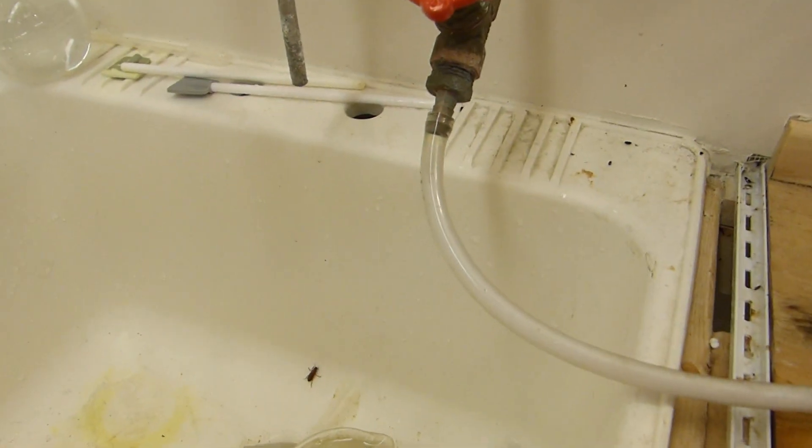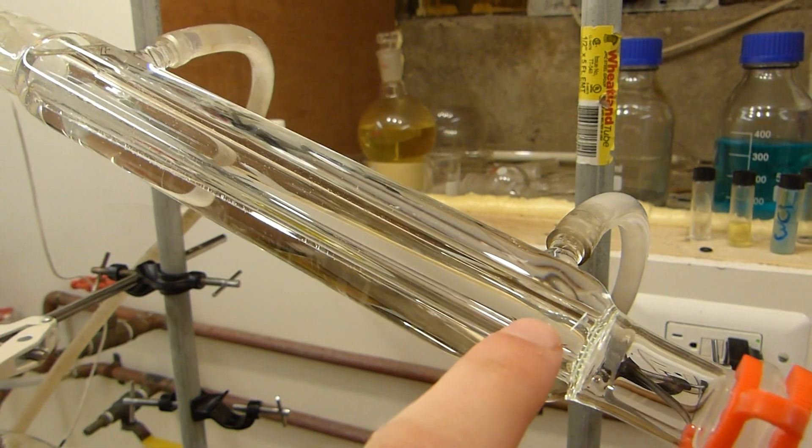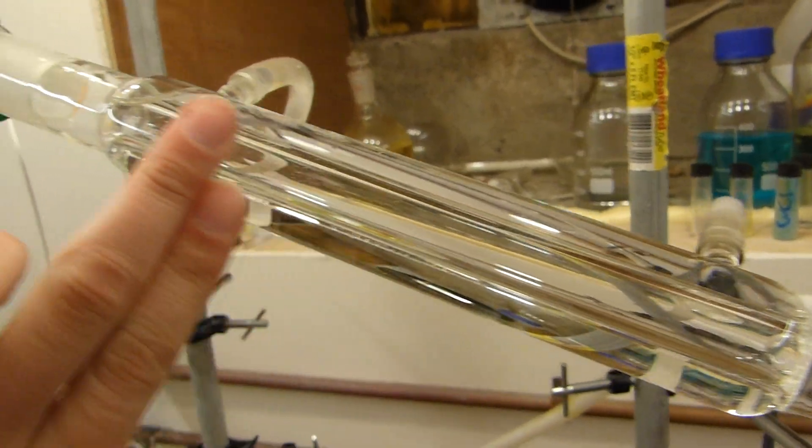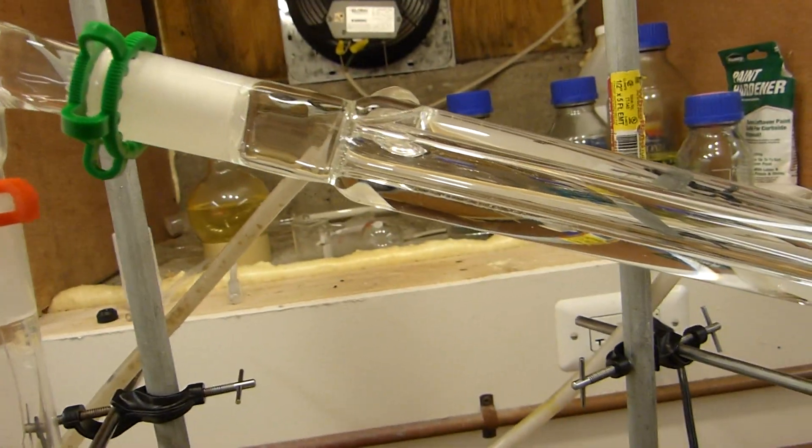Anyway, so the water line there comes from that valve and runs up here. It's hooked up to the bottom of the condenser. Always water in down here and water out up here. That way you have a much colder region here and it gradually gets warmer as you get to the top. It's just good practice. There's a lot of reasons behind that.